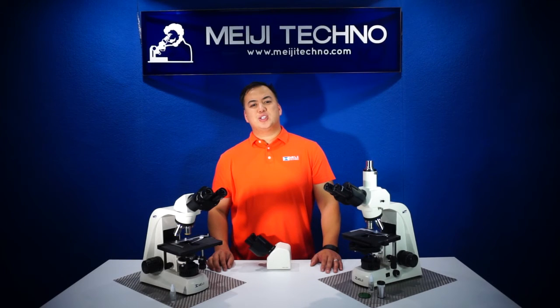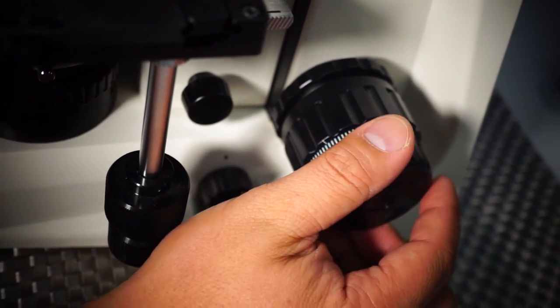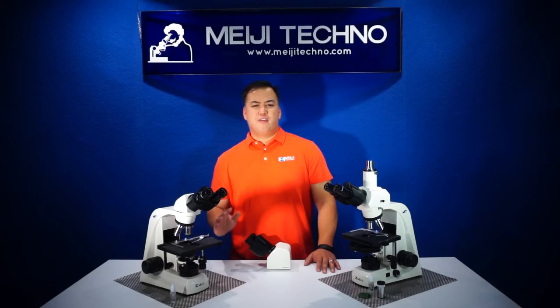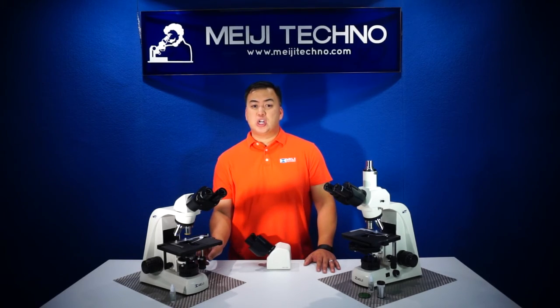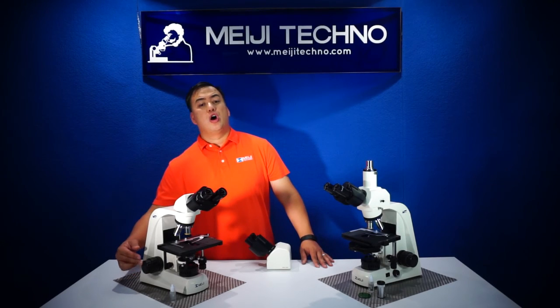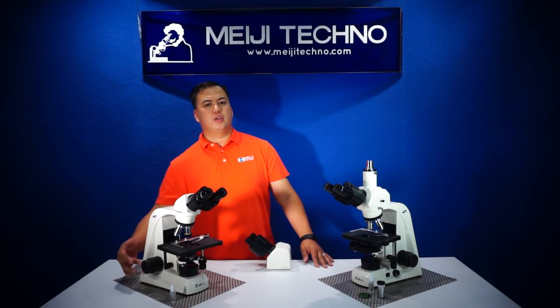The MT4000 series has been designed with an improved low-position focusing control that allows users to work without repetitive stress. Very ergonomic in design, with a travel range of 23 millimeters and a fine focus rotation of 0.2 millimeters per revolution.